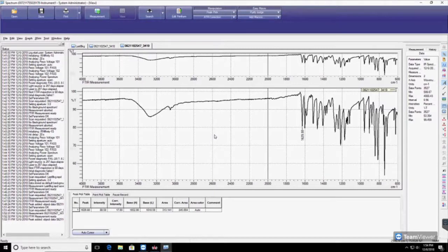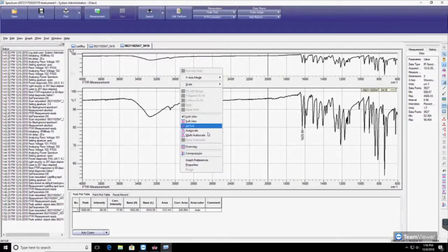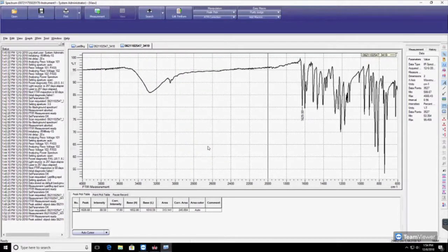To exit, collect the data that appears in the box. When you're ready, you can print your results under the File menu.